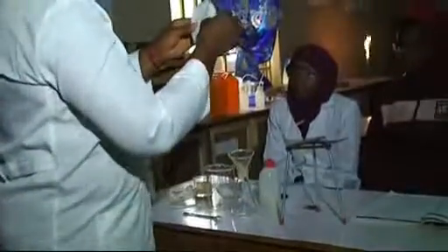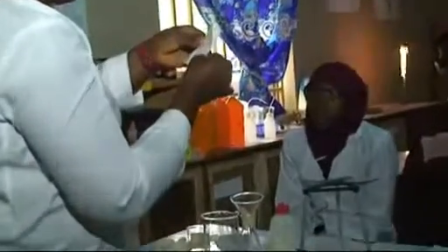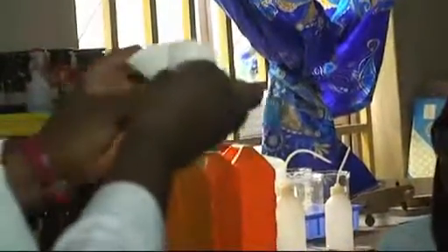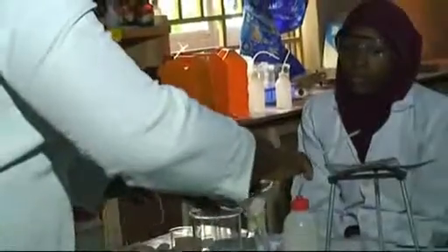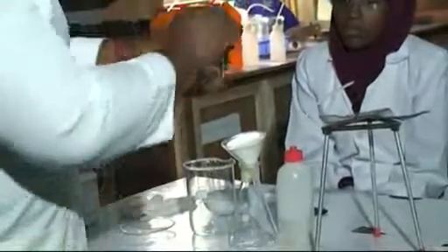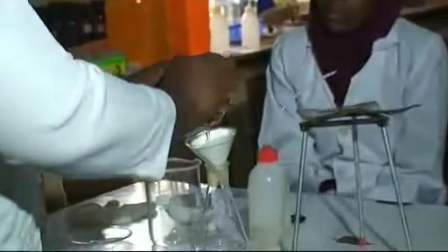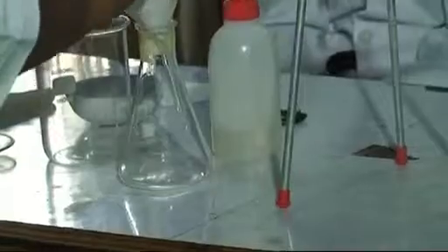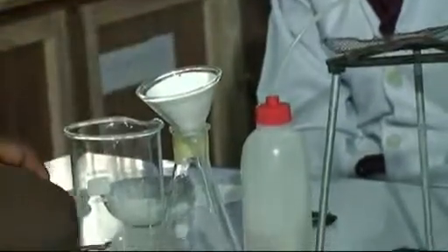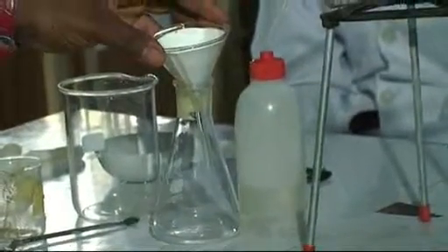Now with your filter paper, fold it in two. The first one, fold it again. Now open it, three to one side and one on its own to form a cone like this. Now place it into the funnel. You can now pour in your mixture and the water into the funnel. Now you allow it to filter.